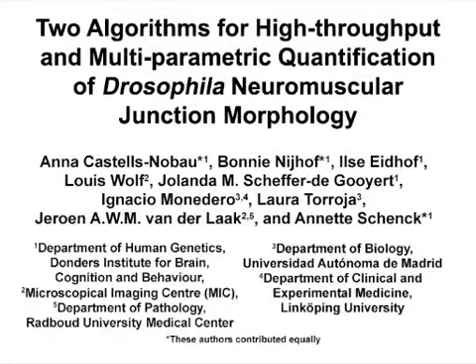The overall goal of this procedure is to automatically quantify morphological features of the Drosophila neuromuscular junction using morphometric software macros. This method can help to identify regulators of synapse development, a key question in neurobiology. The main advantage of this technique is the automatic quantification of multiple NMJ features.